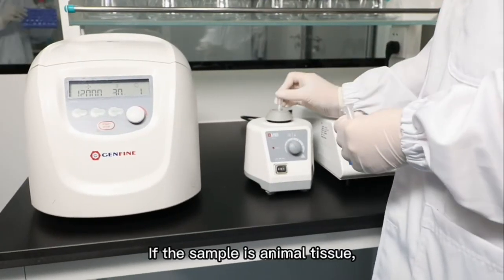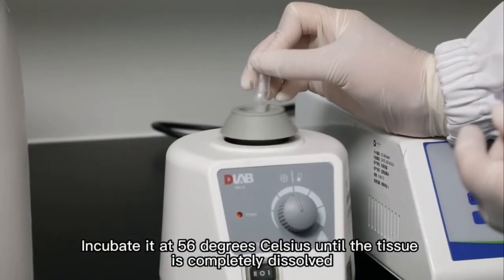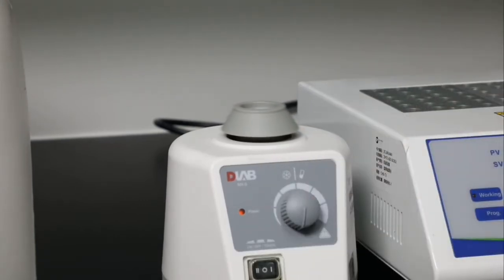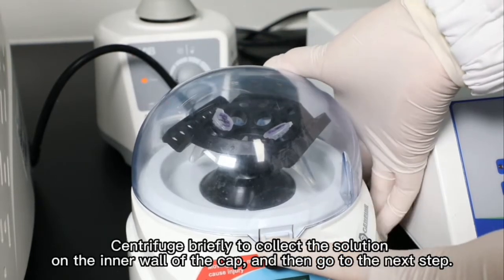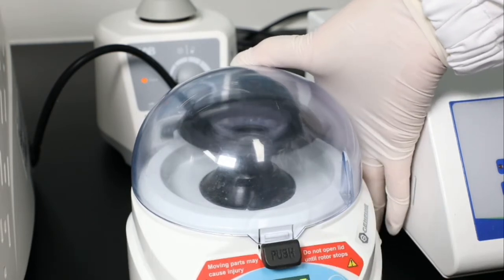If the sample is animal tissue, incubate it at 56 degrees Celsius until the tissue is completely dissolved. Centrifuge briefly to collect the solution on the inner wall of the cap, and then go to the next step.